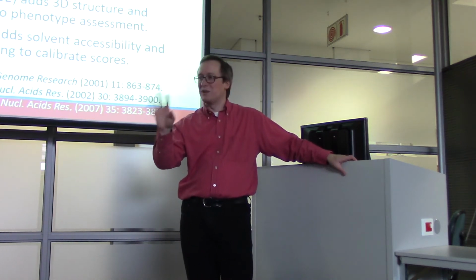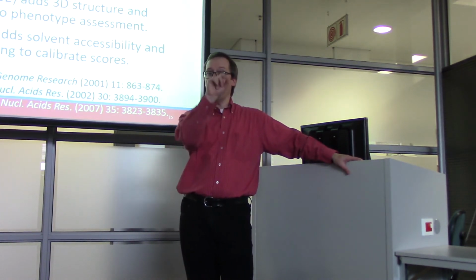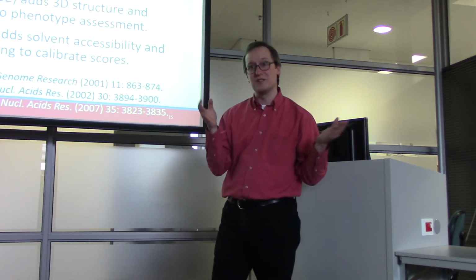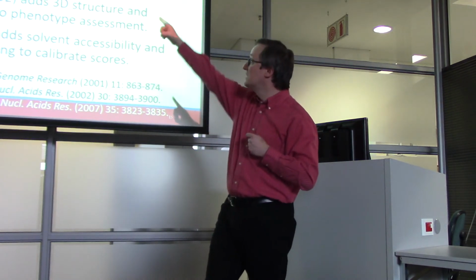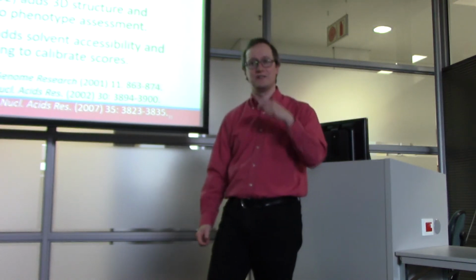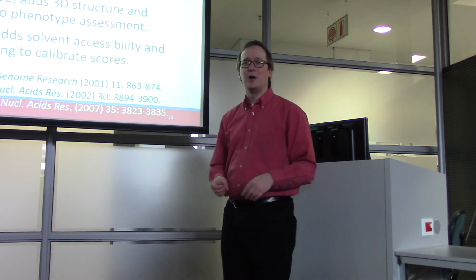Generally, that's weak, but it's true. We tend to focus our attention on those mutations in genetic sequence that change amino acids, or that do things like induce a stop codon. So non-synonymous means changing the resulting amino acid sequence. SNV means it's a mutation at an individual position, or a sequence variant at a particular position. Everyone good with NSSNV? It's not an easily pronounced thing, but it's very helpful when you're trying to write a paper on the subject.